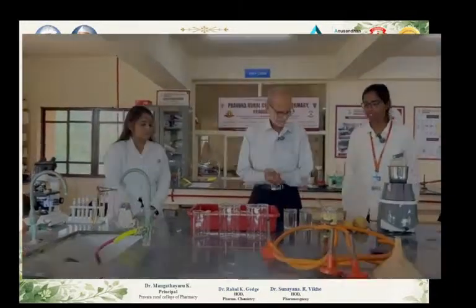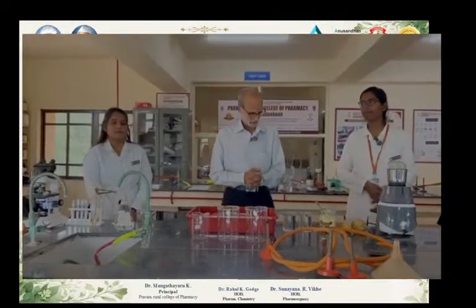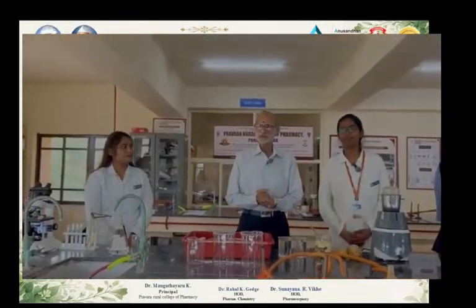Some idea about the starch. We are going to begin with the very first experiment, that is separation of starch from potato.